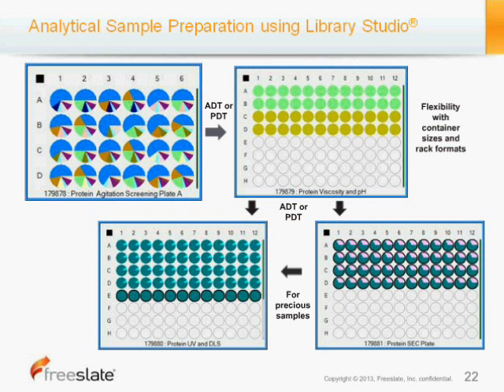You can basically aliquot material from your formulation to a target plate or vial using air displacement or positive displacement. And as I mentioned before, there's flexibility. There's no need to have to do this in 96 well formats or 4x6 formats. This is completely flexible. And then you can even further dilute those materials after testing to other plates.